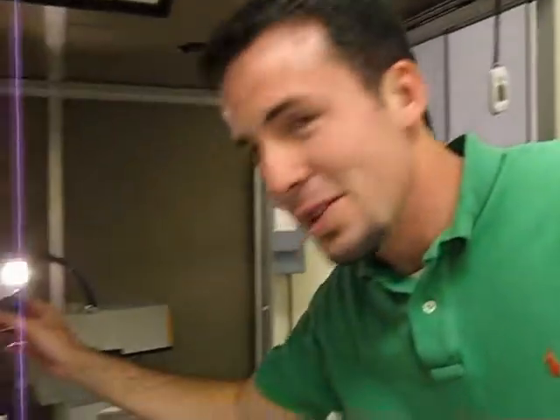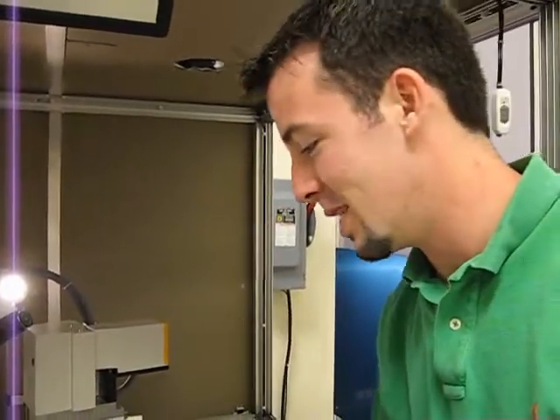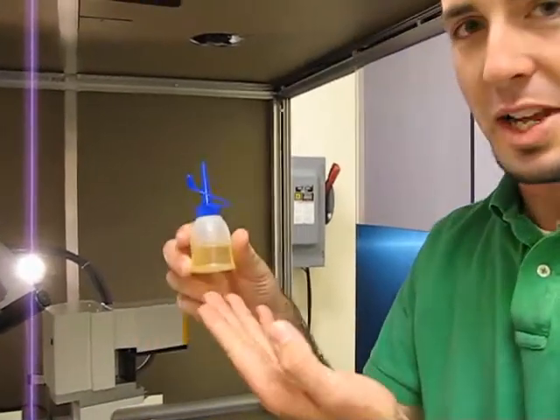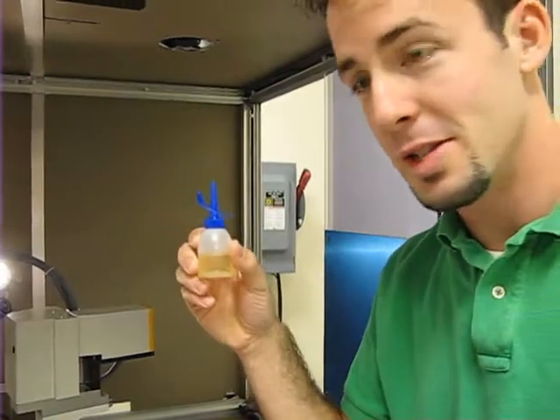Welcome to our next series on X-ray diffractometer usage. Today we're going to talk about how to lube the machine, because with an Inigo machine it needs to be well oiled and well maintained. We're going to use standard lube — a jet oiler — to lube the machine. Shae is going to be the one lubing the machine, so we'll have her show you how to get it properly lubed.